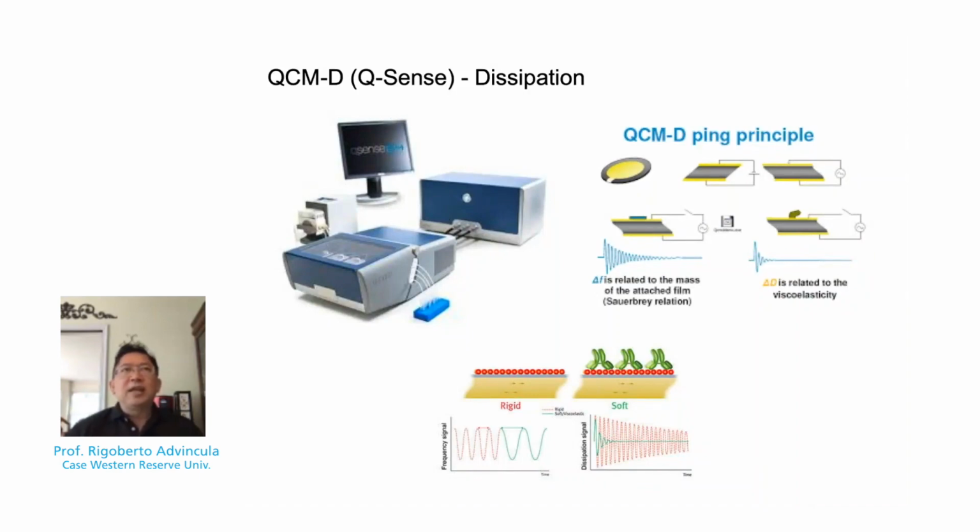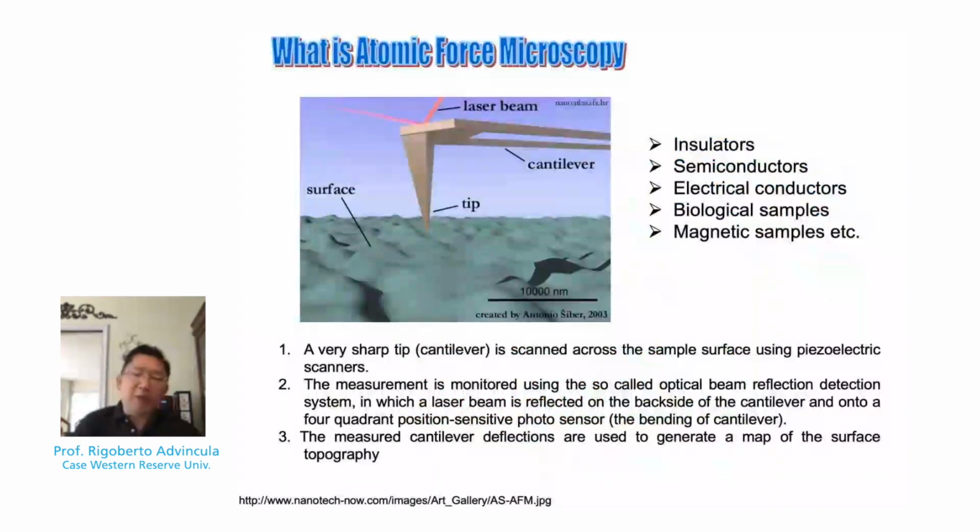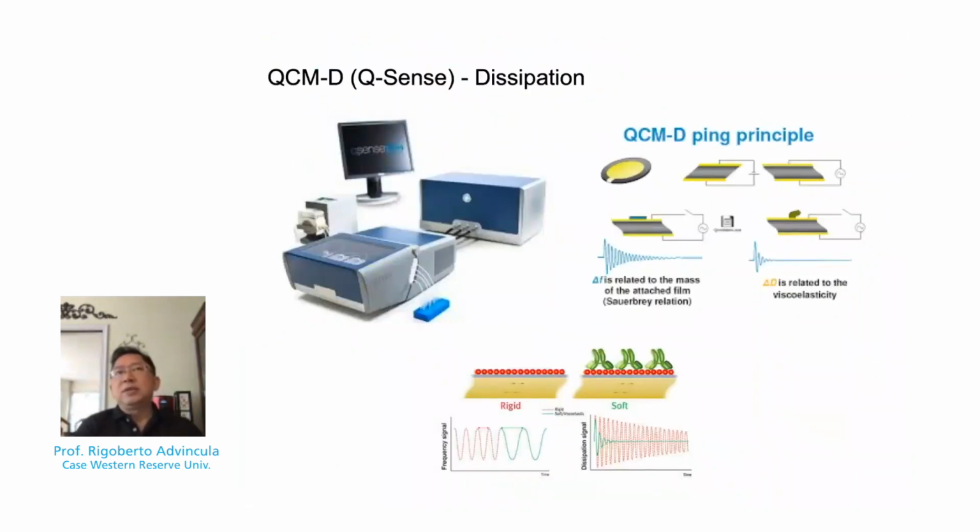So having introduced all I can with QCM, QCMD, I'd like to give a short description of the atomic force microscopy experiment. And then I will close this webinar with combinations of the two experiments, QCM, QCMD, AFM, and then finally instrumental configuration where the two have actually been simultaneously utilized.